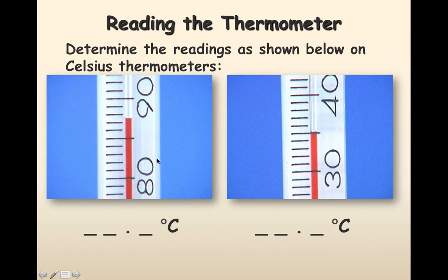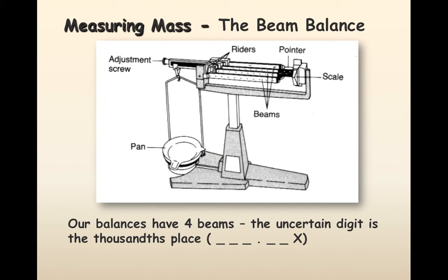So same kind of deal. These are roughly like the thermometers we would use in the sense that they have just 1 degree divisions. And so you can see there's 85, 86, 87. So we know we're between 87 and 88. And so the estimate's 87.4. You might look at that and say, no, it's 87.5. No problem. Next one, we see it's right around the 35 mark. So that's fairly definite. And they've argued it's 0.0. You might argue 0.1. It's really borderline.